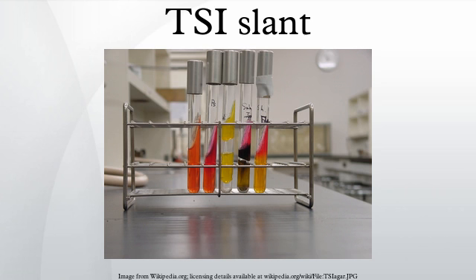Interpretation of results: bacteria that ferment any of the three sugars in the medium will produce byproducts. These byproducts are usually acids, which will change the color of the red pH-sensitive dye to a yellow color. Position of the color change distinguishes the acid production associated with glucose fermentation from the acidic byproducts of lactose or sucrose fermentation. Many bacteria that can ferment sugars in the anaerobic butt of the tube are enterobacteria.